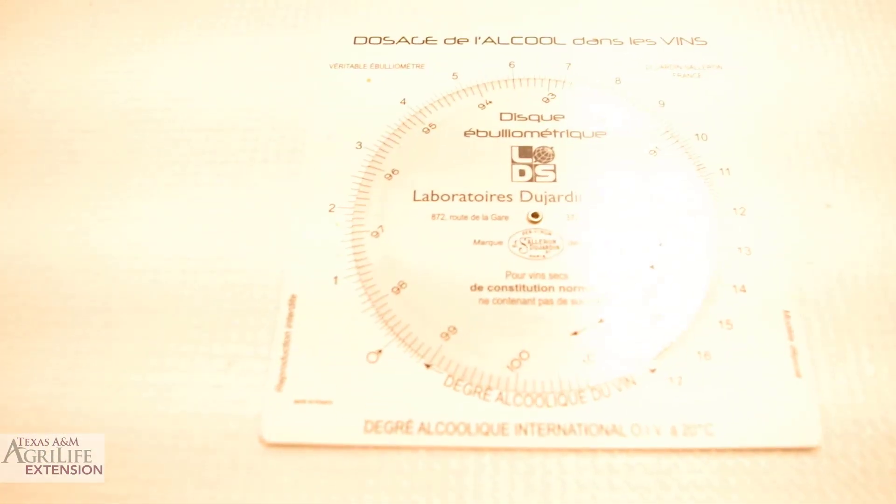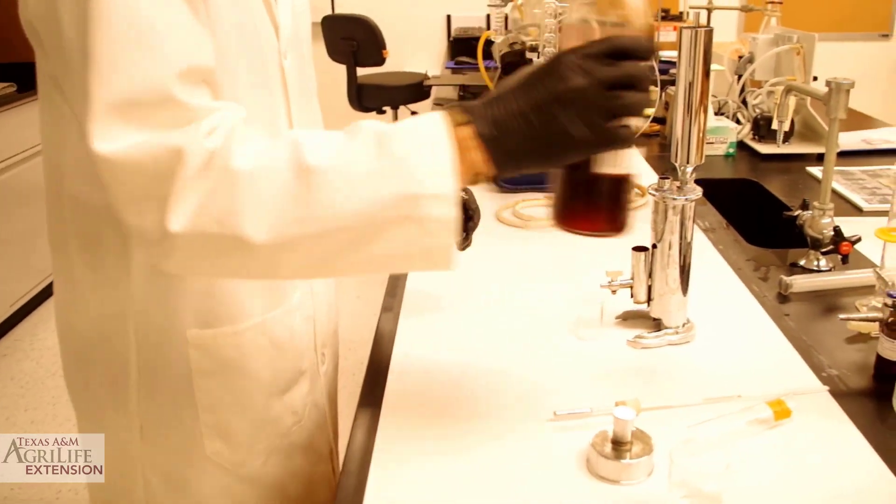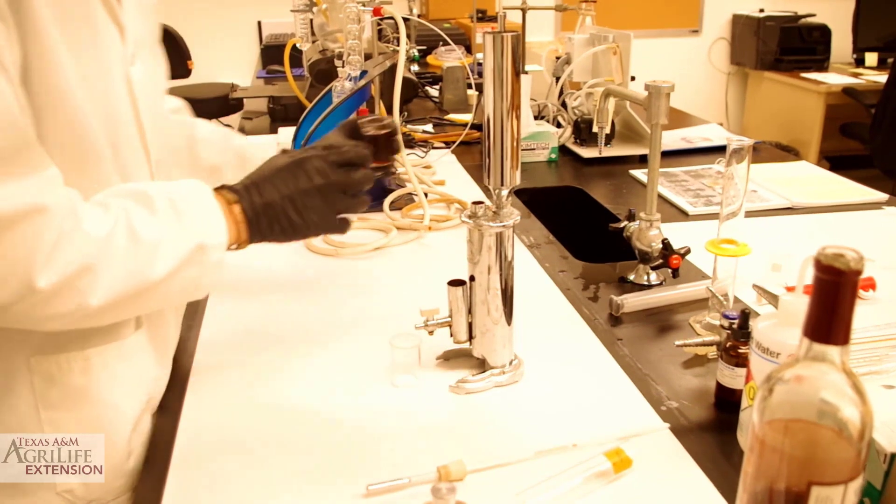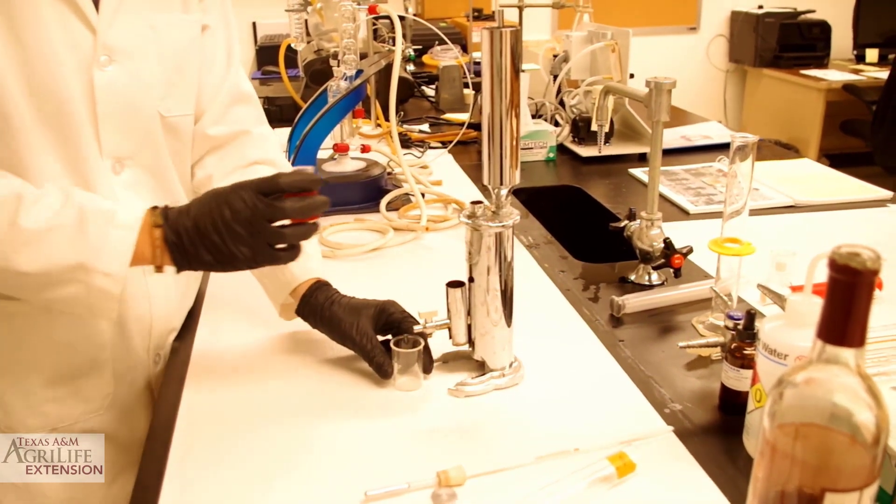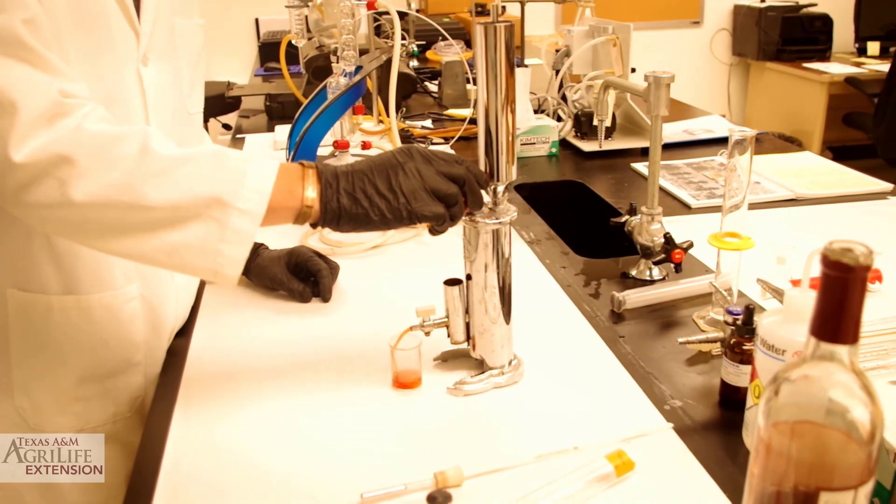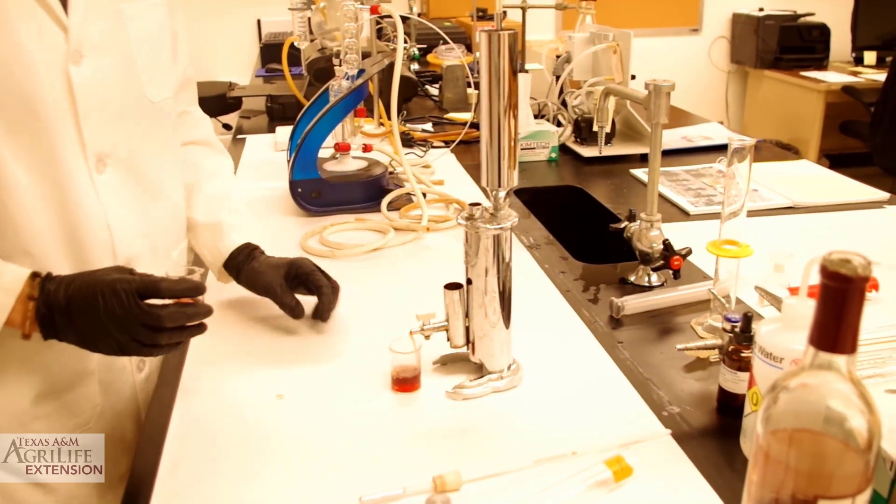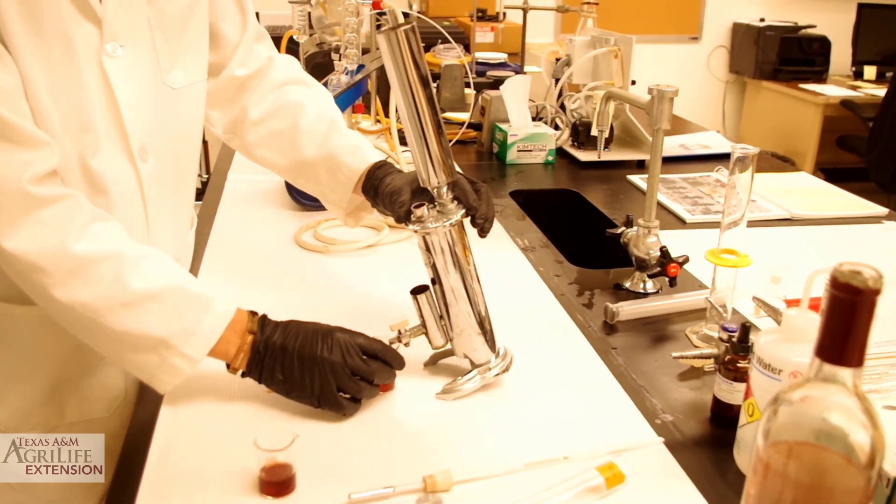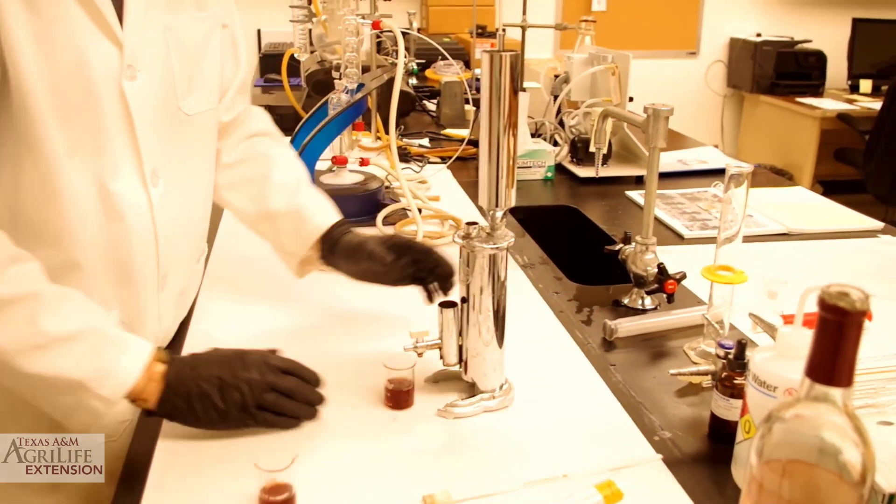We are now ready to run our first wine sample. First, we rinse our boiling chamber with a little bit of wine from our wine sample. Make sure you have a waste beaker placed underneath the spout and that the spout is open. Tilt your ebuliometer slightly forward so that the boiling chamber is completely drained.